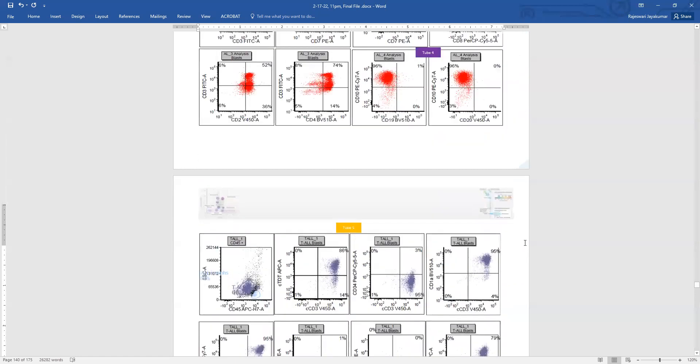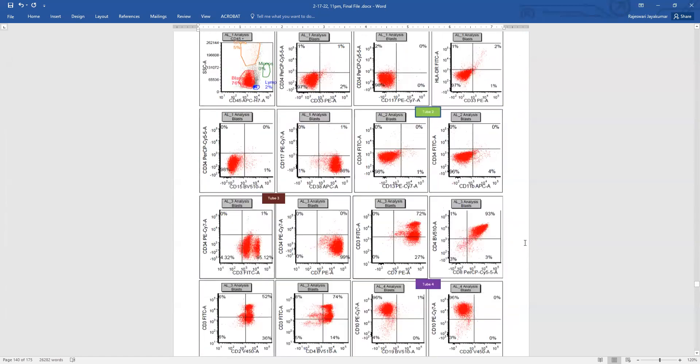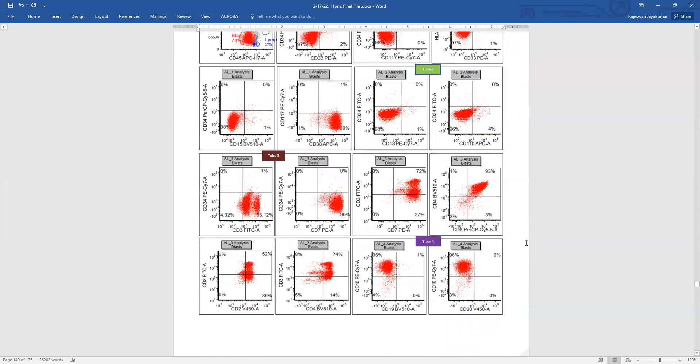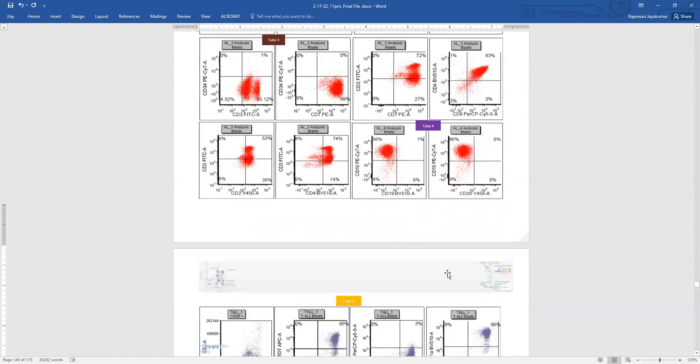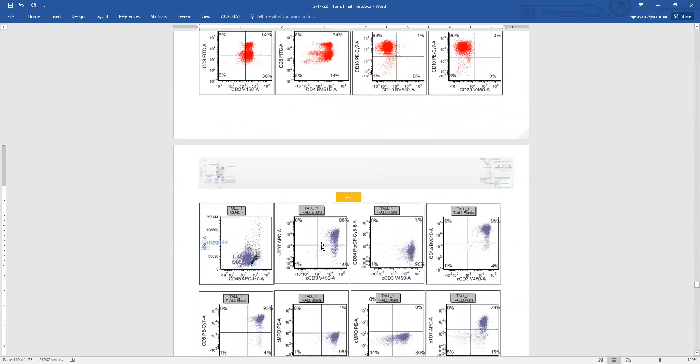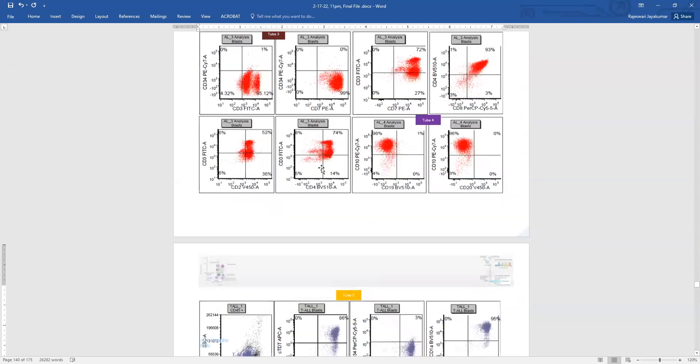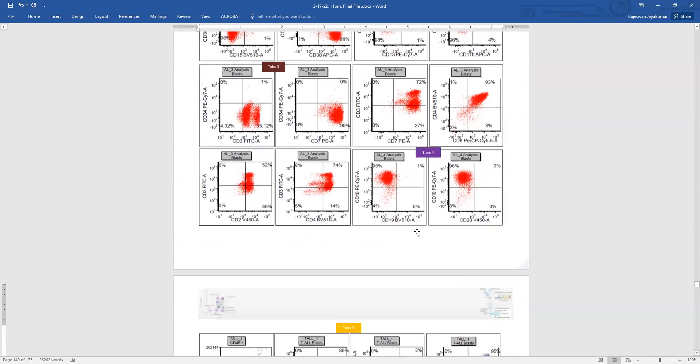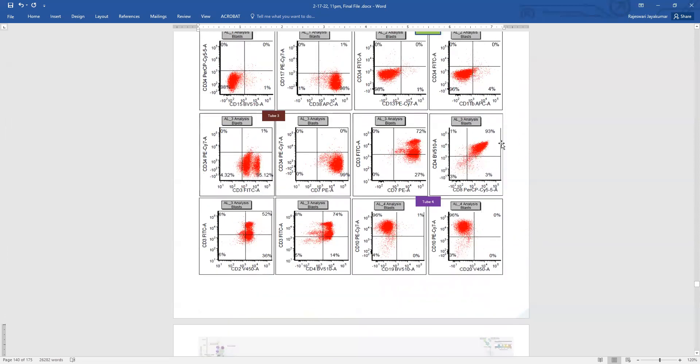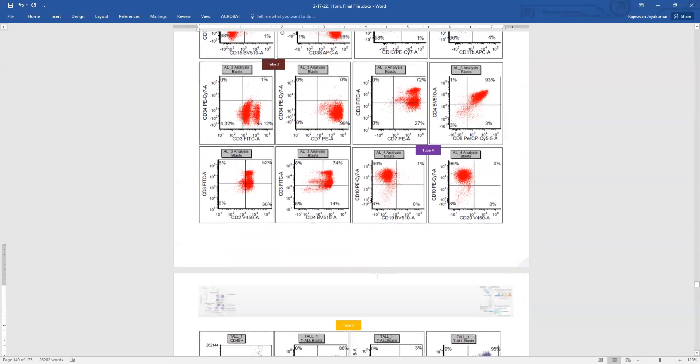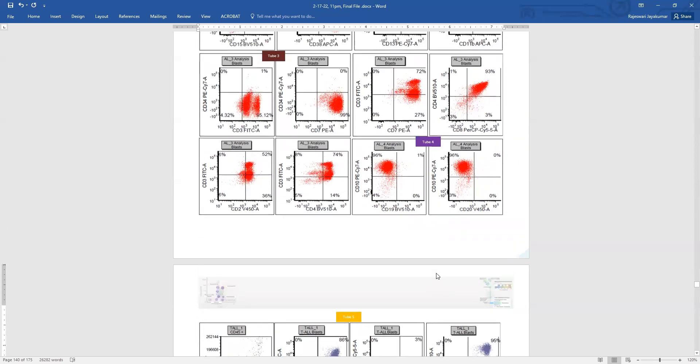So the main differential diagnosis in a mediastinal mass is thymus versus T lymphoblastic leukemia. So this one is straightforward because we have TDT expression, and we have both surface and cytoplasmic CD3 expression. This is double positive for 4 and 8, has bright 7, 2, 5, everything, and it has 10. So it's a typical thymic lymphoblast morphology. How do we differentiate this from thymus?